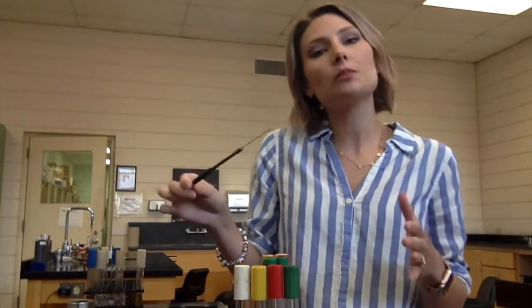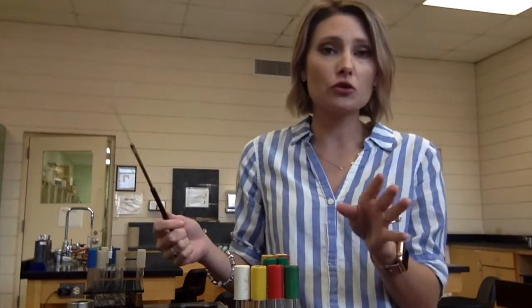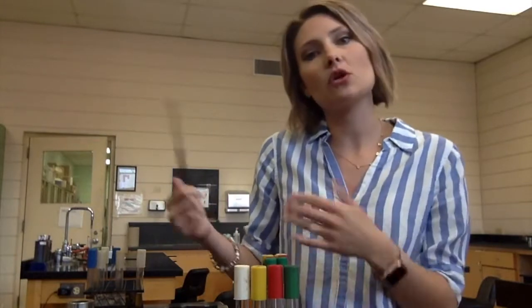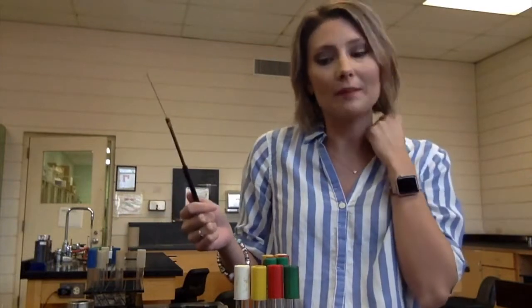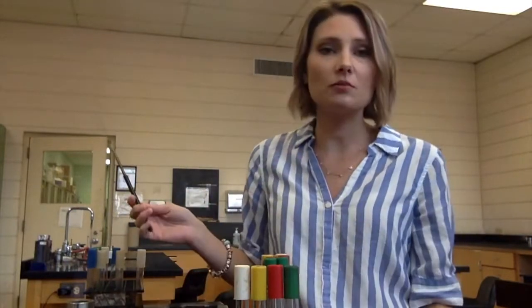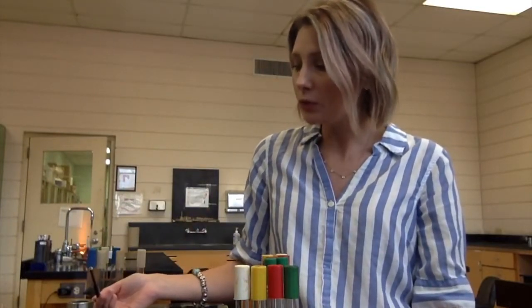Okay, now in your book, there's 4 different bacteria that are named for this test: E. coli, Citrobacter freundii, Proteus vulgaris, and Pseudomonas aeruginosa. All of those are gram-negative organisms. I'm only going to do 1 because there's no need in me repeating this 4 different times, but that is what would normally be in your lab manual. So of course we want to use aseptic technique, so I'm going to use my Fireboy. I'm going to flame my loop.